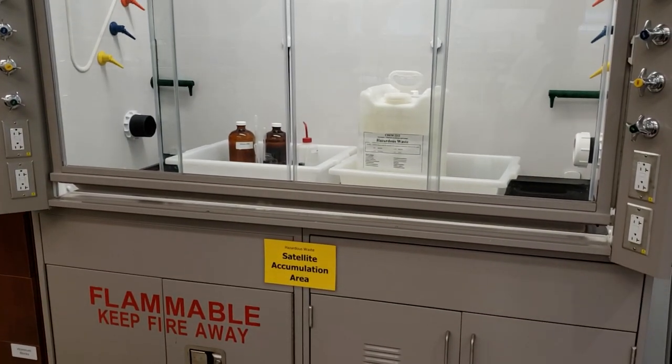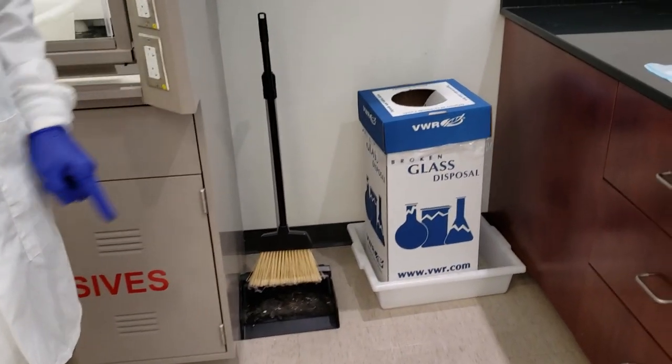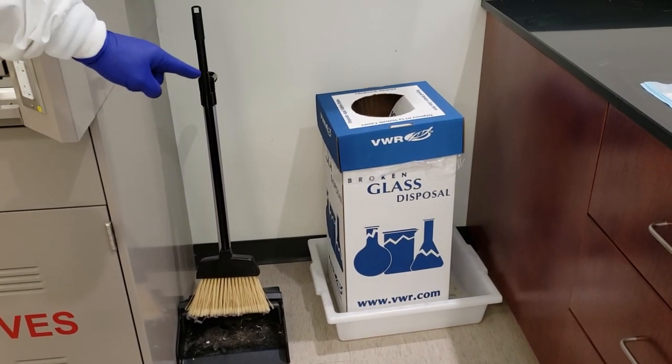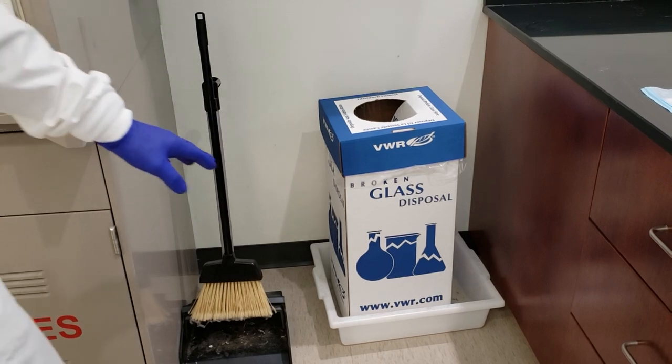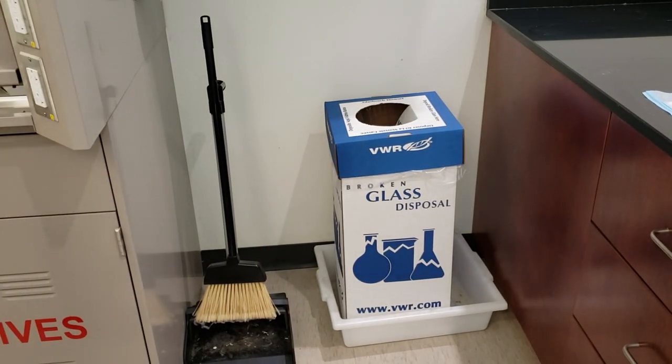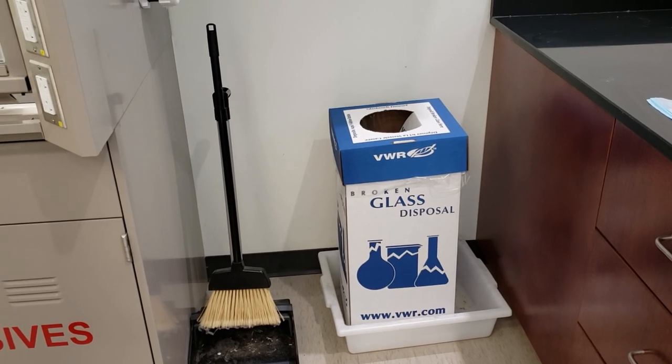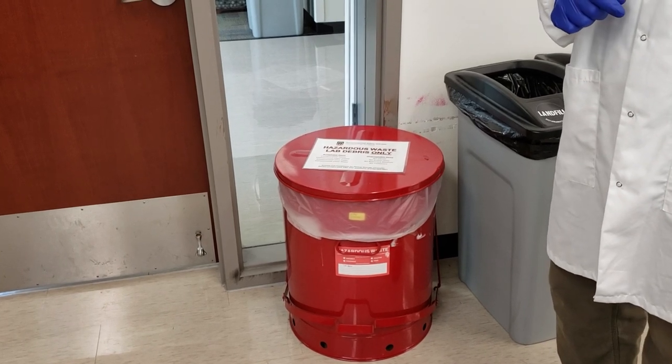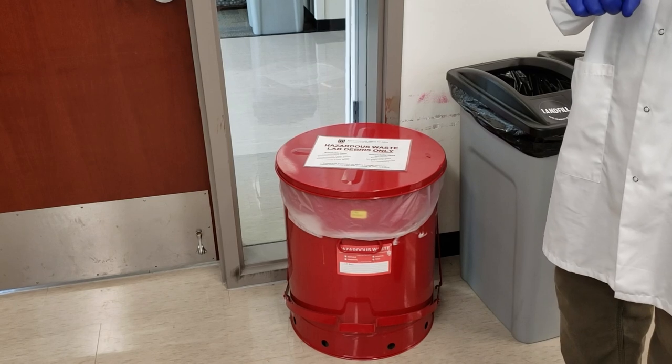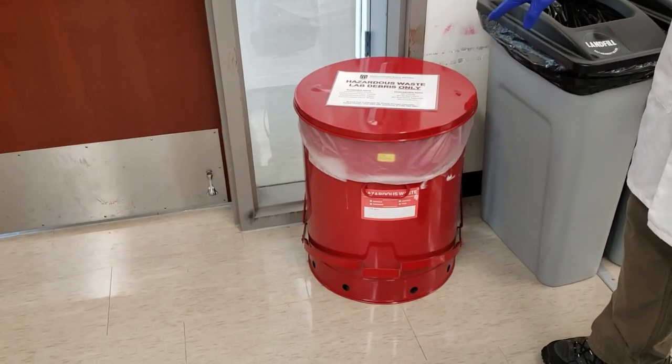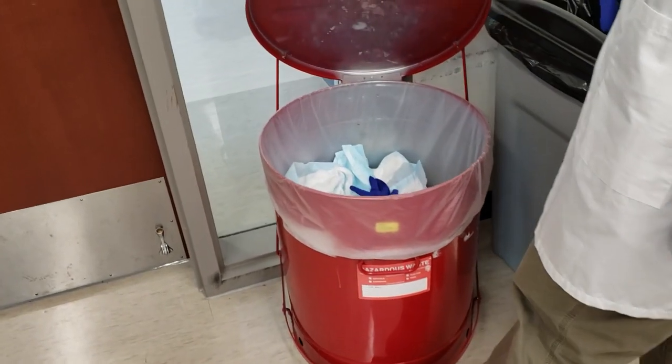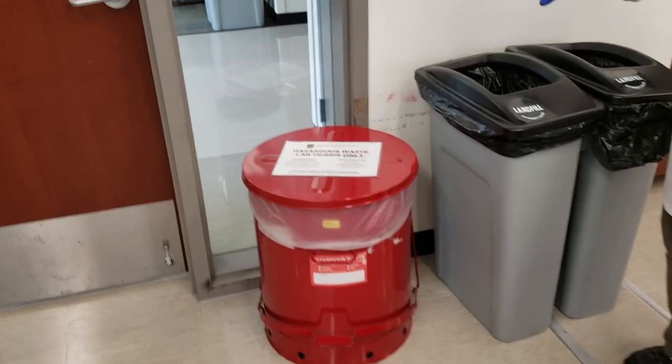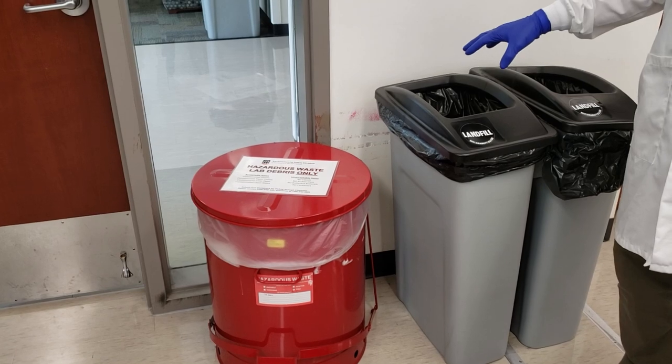Along with these safety systems, we have our broken glassware disposal. If you break a piece of glassware, pipette, or capillary tube, it always goes into broken glass, never regular trash, to ensure nobody gets cut. We have a cardboard exterior to keep broken glass safe. Just like the broken glass container, there's only one place students can discard gloves, filter paper, and paper towels that contact chemicals: our red hazardous waste lab debris-only cabinet with a hands-free step on the bottom. No gloves ever go in regular trash. That's extremely important.